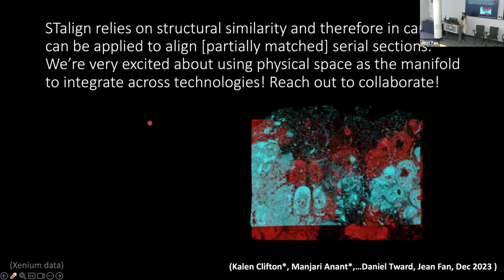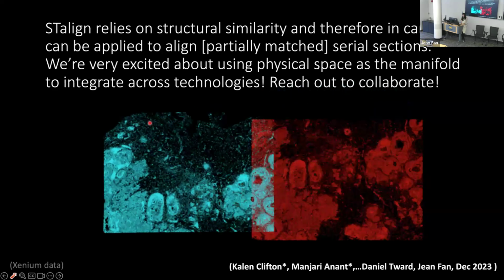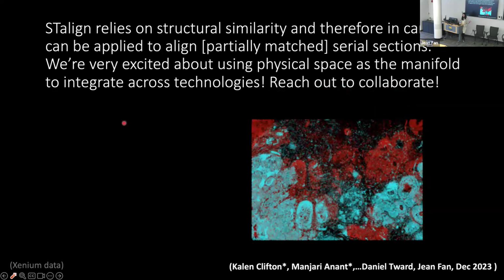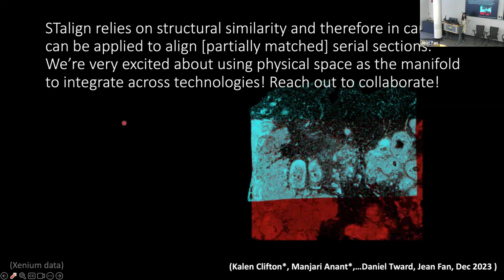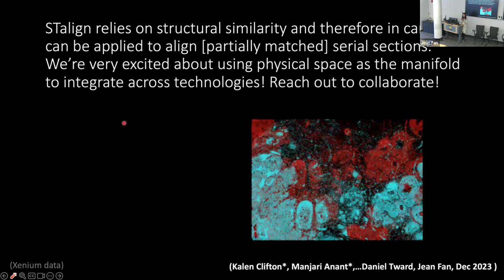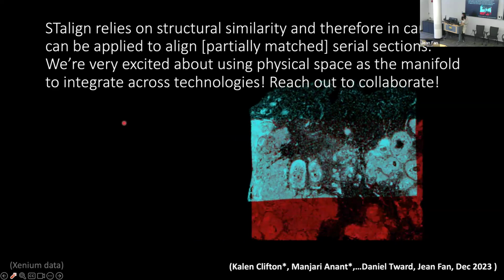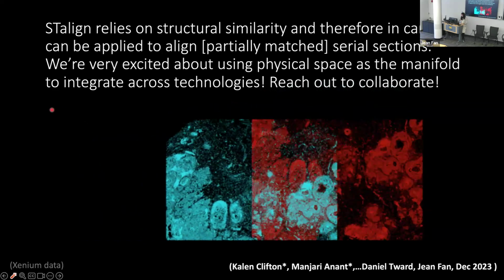You can try to do this kind of dimensionality reduction and clustering in this higher order manifold space. But we're actually very excited to use physical space as the anchoring point. So when we subject these different tissue sections to these different technologies, can we use physical space to register them back together and begin integrating across these multi-omic platforms by using, again, physical space as the anchor.